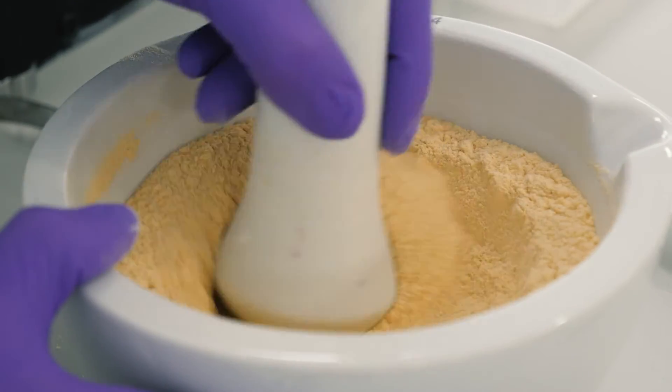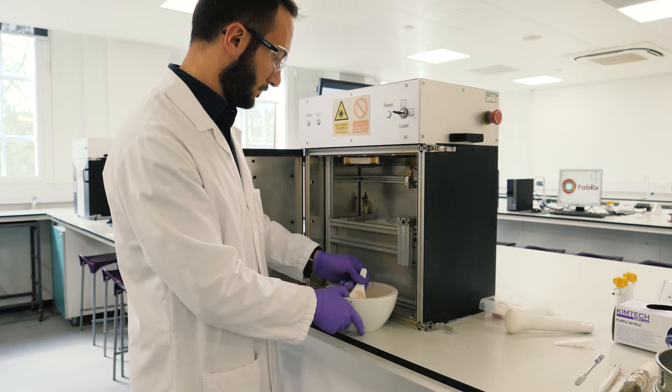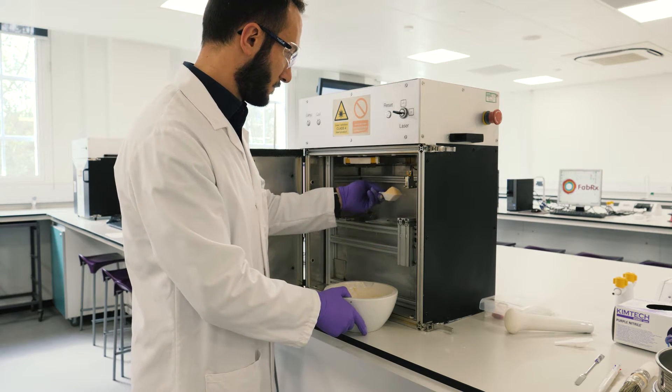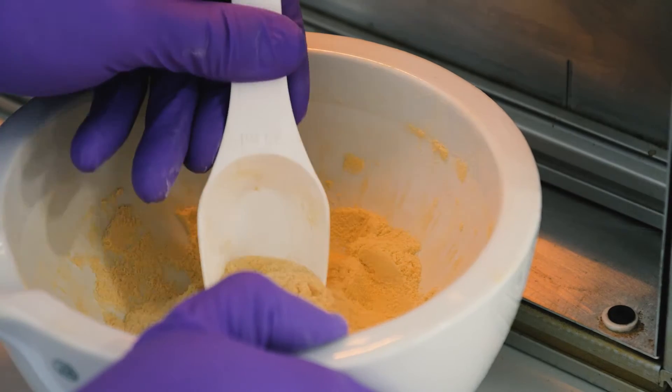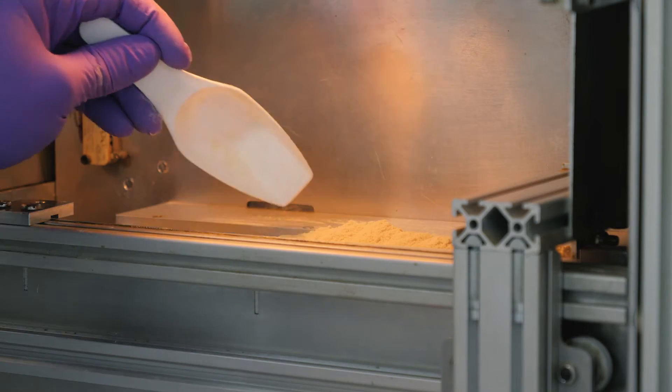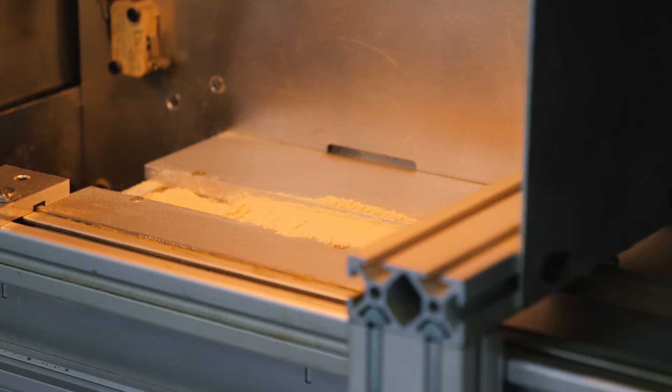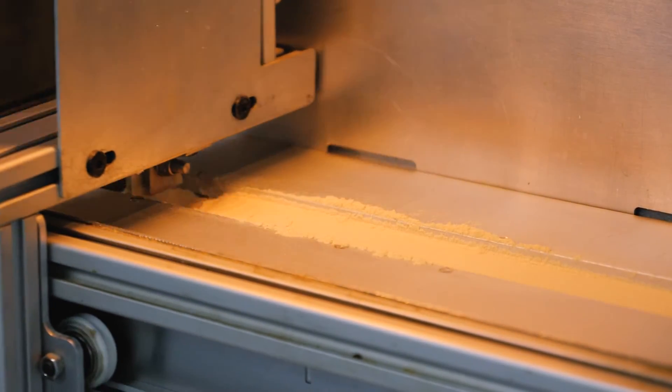We were very interested in selective laser sintering because we don't need to use a liquid as a binder, we just use a powder and a laser and the precision of the laser is something we were looking for. So one of our research directors found Sintratec as a manufacturer of SLS systems and it was a system that we hadn't been able to purchase before because the cost is very high but because you supply a system which can be kit built, it was a very affordable system and so it was an opportunity to explore a technology we couldn't use before.